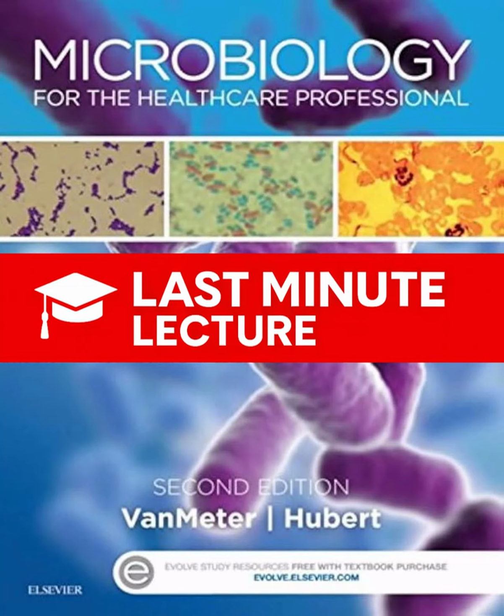It's a four-step process, isn't it? Crystal violet first. Yep. Step 1, flood the slide with crystal violet, the primary stain. Everything turns purple. Step 2, add Gram's iodine. This acts as a mordant. It doesn't really add color, but it complexes with the crystal violet inside the cells, forming these big crystal violet iodine, or CVI, complexes. Makes the dye harder to wash out.